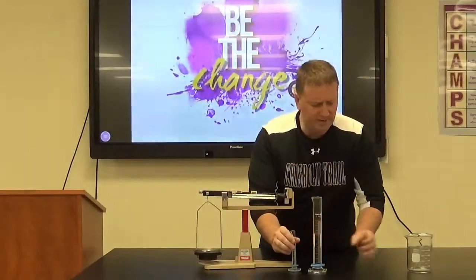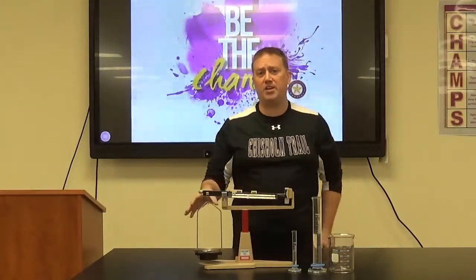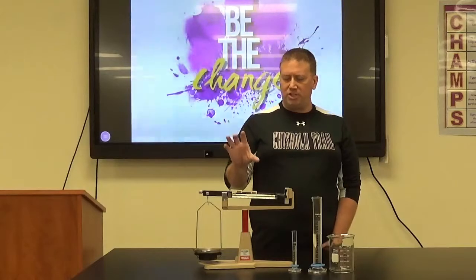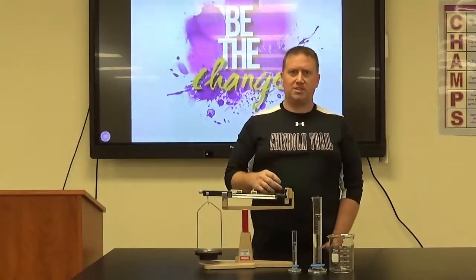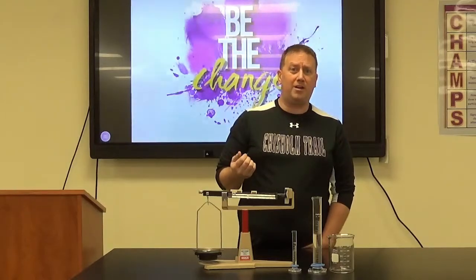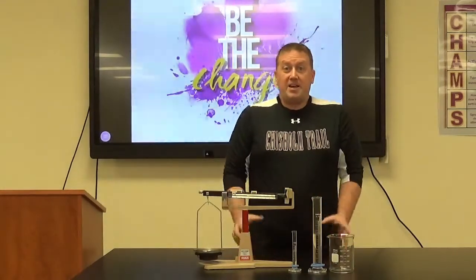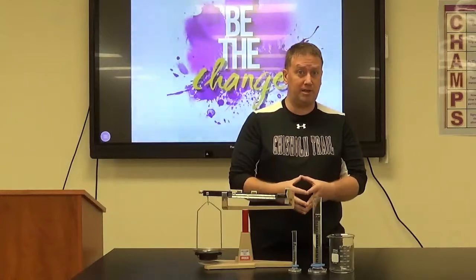That's a real quick demonstration of how to use these different pieces of equipment. Like I said, we'll be using these throughout the year as we do different labs, as I do demonstrations, things like that. The main topic of this unit is measurements. So know what accuracy is, know what precision is, and get a feel for using what I've talked about today. Get a feel for figuring out, okay, if I need to take this measurement, then I need this type of equipment. If I need to measure the volume of a liquid to a 1/10 of a milliliter, I need this small graduated cylinder.